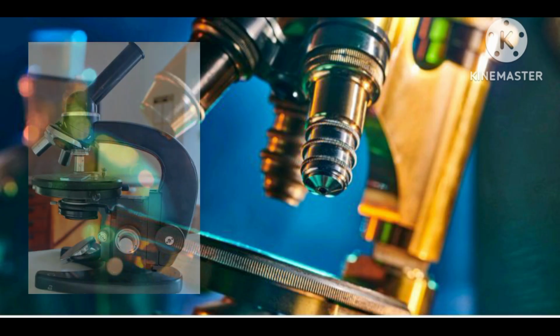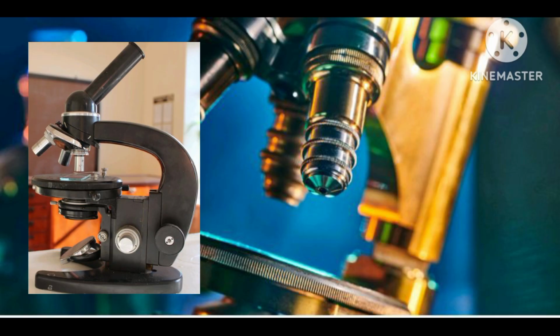The optical parts of the microscope are used to view, magnify, and produce an image from a specimen placed on a slide.